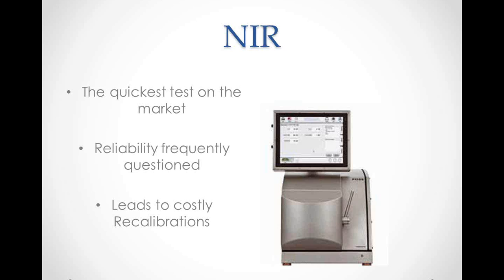So one rapid online measurement that we've seen find its place in some laboratories is the use of near-infrared technology. These systems can typically give a result in about 10 seconds and can determine many different parameters from moisture, fat, protein, pH, salt, and bone content. However, many of the labs I've spoken with have two main concerns with this technology.